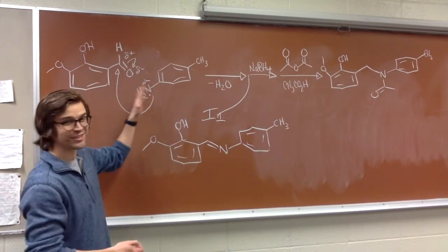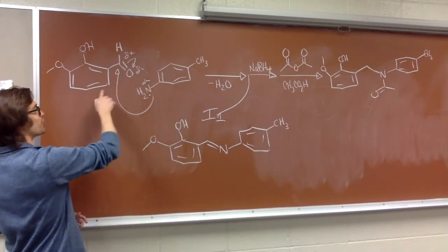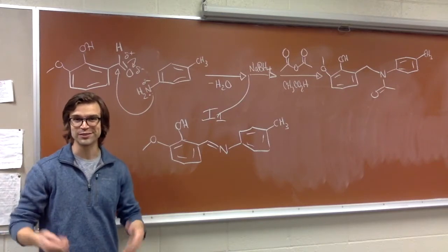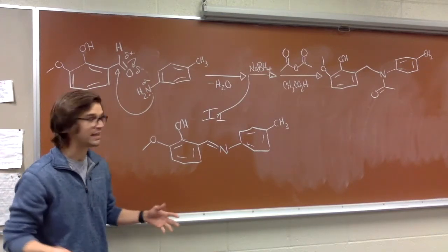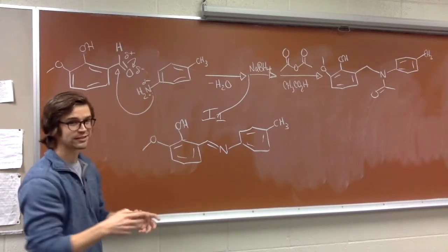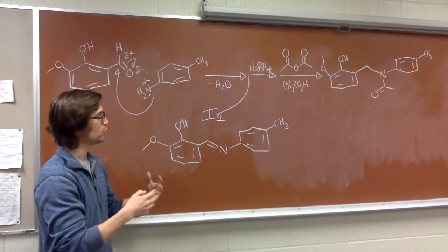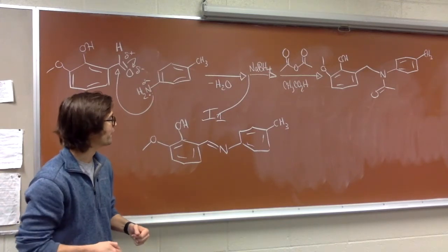But this is a solid-solid reaction. Oh, right. So yeah, we're going to mix that solid with that solid. There's no solvent, there's no other additives. We're just mixing the two of them, and it's going to be pretty neat. We're going to start with the solid thing that we're stirring, and it's going to become a liquid, and then it will re-become a solid. It's going to be really neat. Wait on for that one.